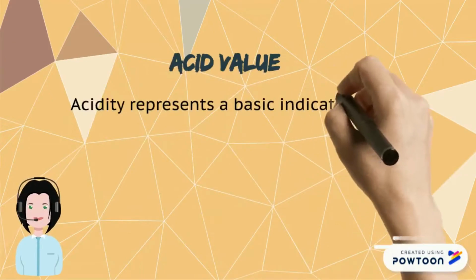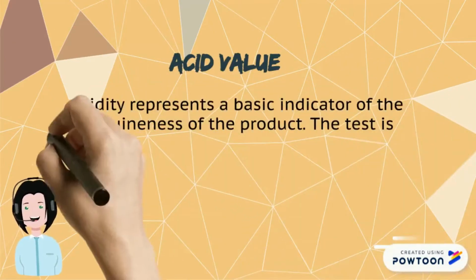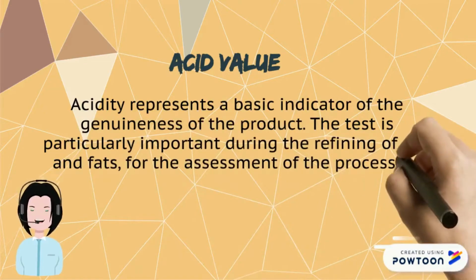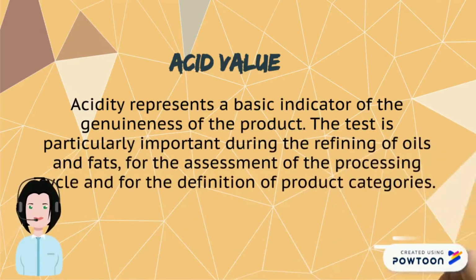Acidity represents a basic indicator of the genuineness of the product. The test is particularly important during the refining of oils and fats, for the assessment of the processing cycle, and for the definition of the product categories.